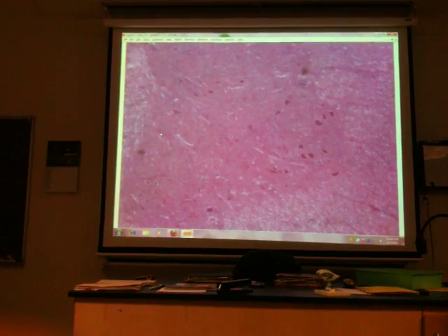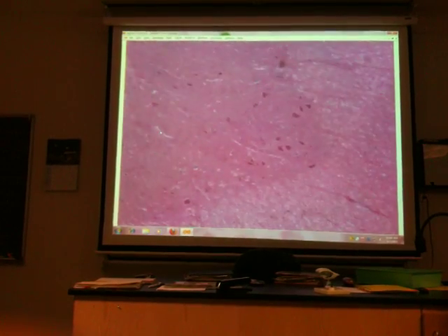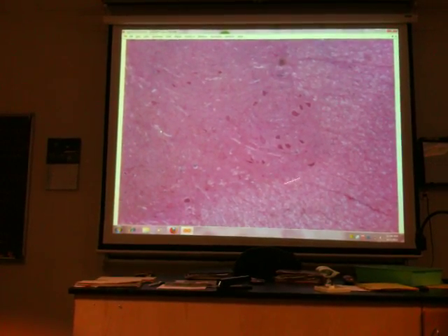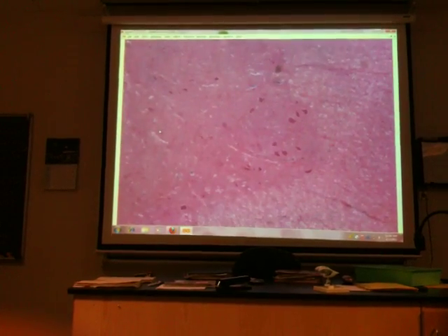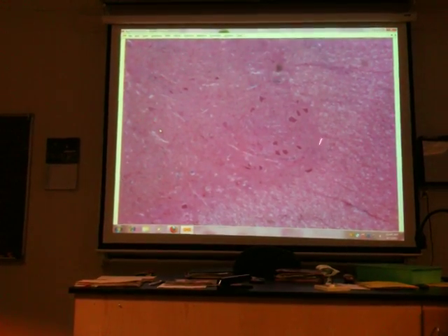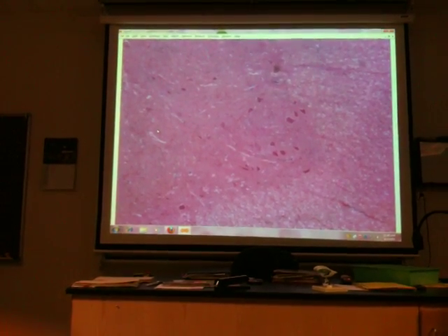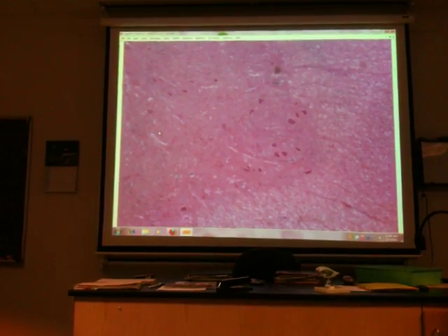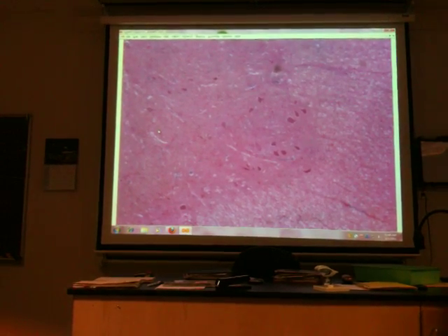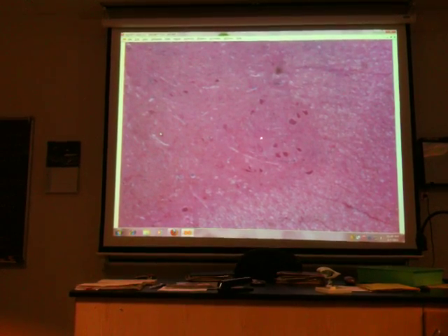And before we get up to the dorsal gray horn, and a little bit before we get midway, see this bulge? See how it comes out laterally? A lot farther than if you keep going up. Lateral gray horn. And we have some large cell bodies here. Can that back table tell us what kind of neurons these cell bodies belong to functionally? Visceral motor, Kathleen hit it, okay? Visceral motor neurons for visceral motor control.